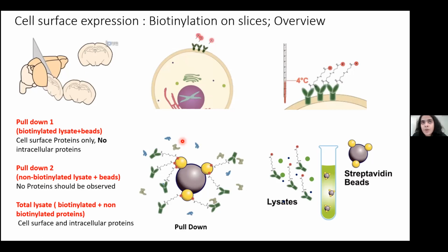I want to make sure that my protein of interest is targeted to the cell surface, that the expression levels of that protein are not changing, and that it's expressed in the region of interest with the mutation of interest. Because we're trying to prove that it's just the homophilic cell adhesion that causes the phenotype.